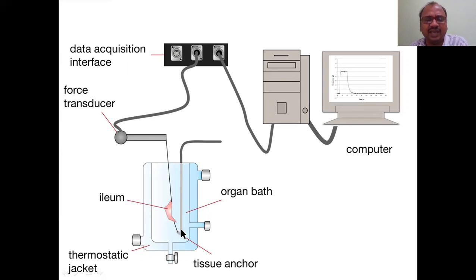See here, you have to maintain the tension on this lever whenever it is writing. Otherwise, if you are not maintaining tension, even though the tissue contracted, you will not get a curve there. So contraction, tension must be there. That point you have to keep in your mind.